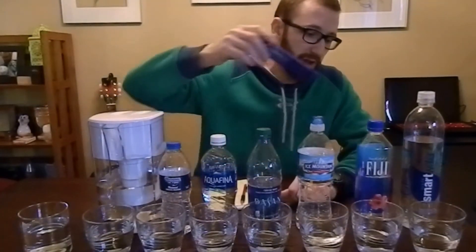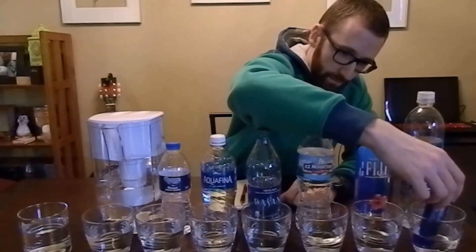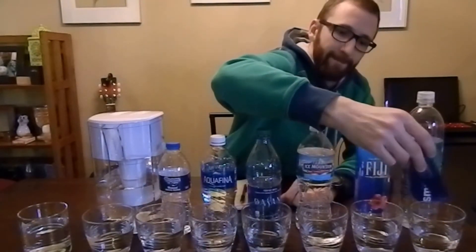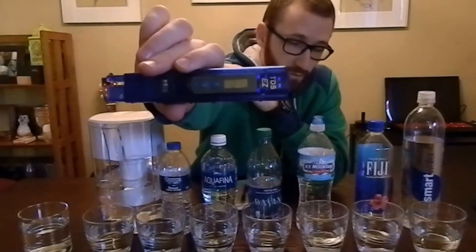The last one we have here is Smart Water. This one is also staying the same as it goes in. Smart Water comes in at 21 ppm.